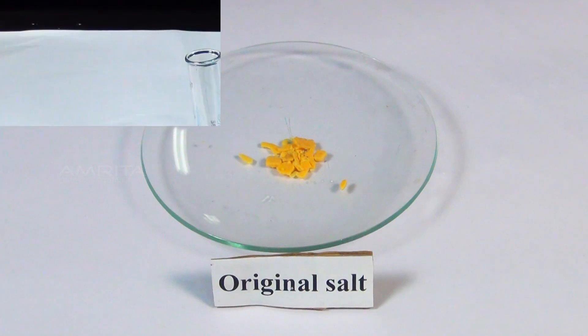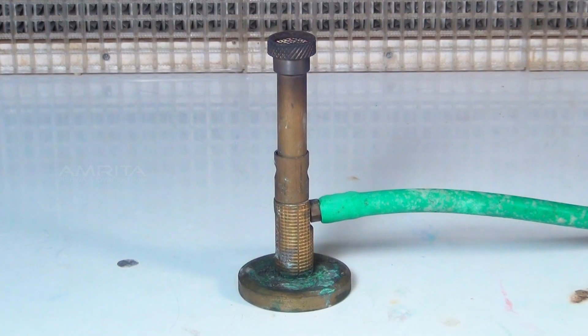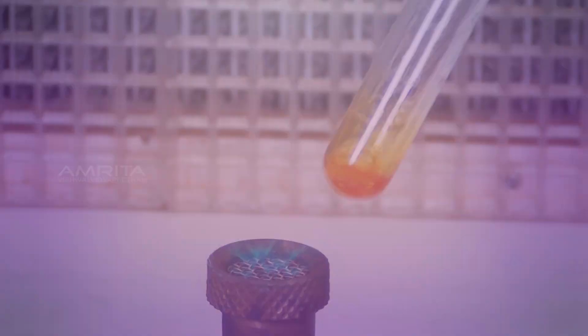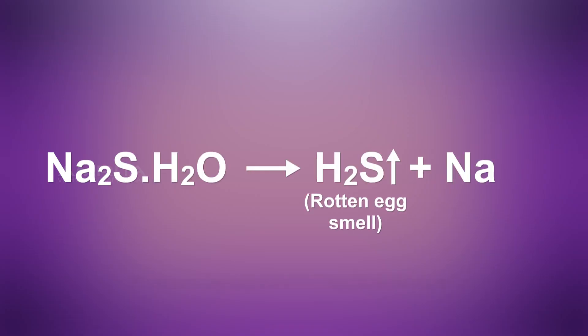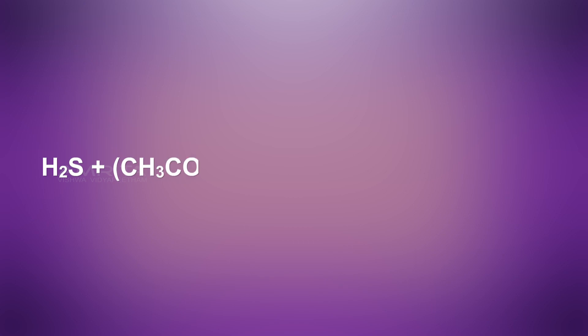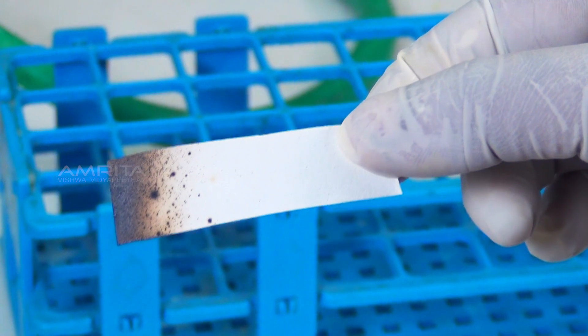Dry heating test. Materials required: original salt, test tube, lead acetate paper, test tube holder, and a Bunsen burner. Procedure: Take a small quantity of the salt in a test tube and heat it over the Bunsen burner. On heating, hydrated sulphide undergoes decomposition to evolve colourless hydrogen sulphide gas, which smells like rotten eggs. Place a lead acetate paper over the mouth of the test tube. Hydrogen sulphide reacts with lead acetate to form lead sulphide, which turns the lead acetate paper black.